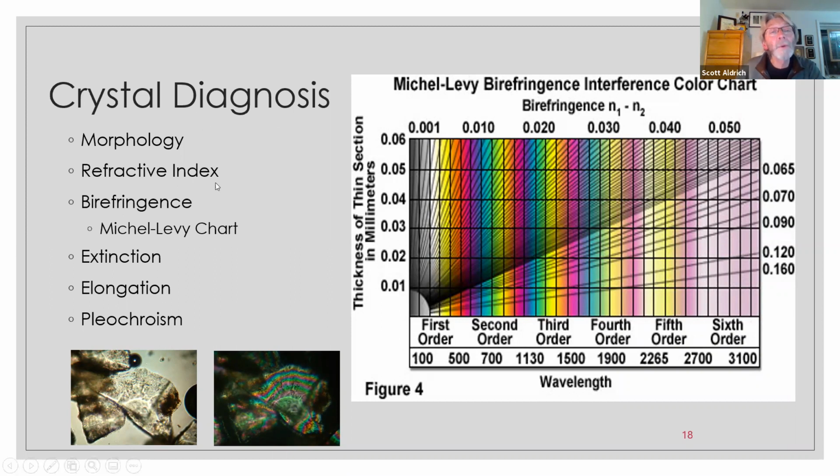And the one on the right, once we stick in the analyzer, we block all the light, since there's nothing to turn the light through the crystal. But once the polarized light goes through the crystal and it goes down 2 different hallways, basically, and comes out the other side, we start to see the color fringes, which all have to do with thickness.